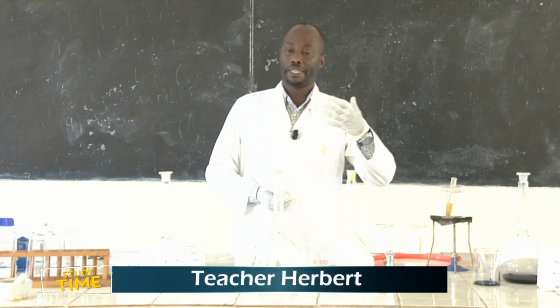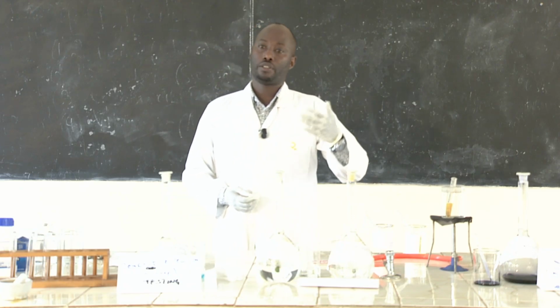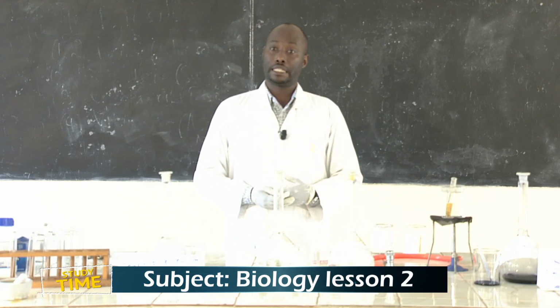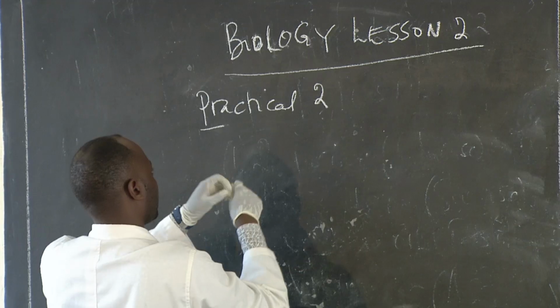I'm again Teacher Herbert. I'm going to be taking you to lesson 2 of biology, a practical biology lesson concerning testing food compounds. What are we testing in those food compounds? We normally test biological molecules. And testing the biological molecules is what we call food testing. This is the lesson of today.